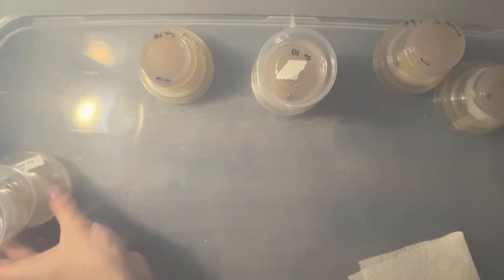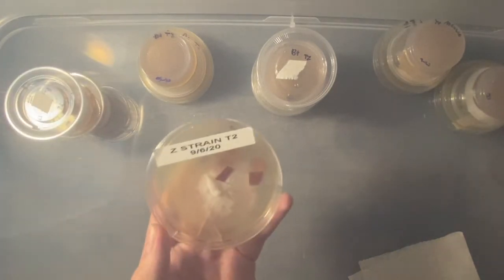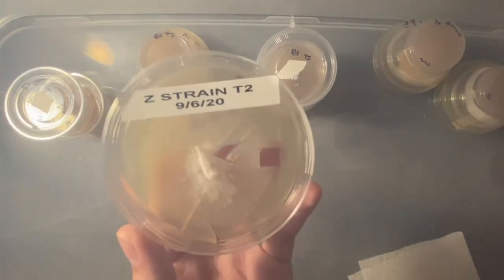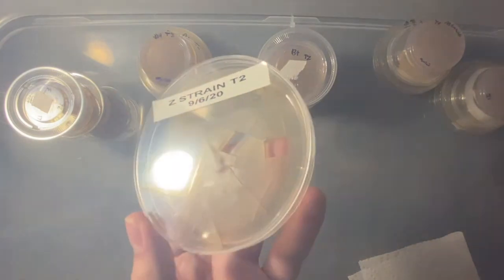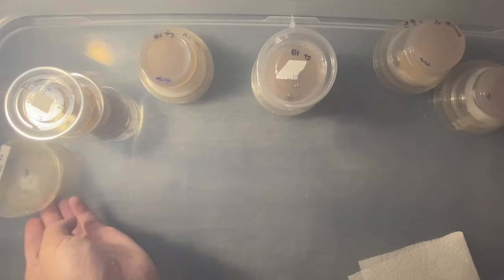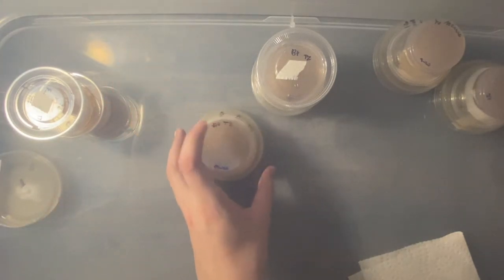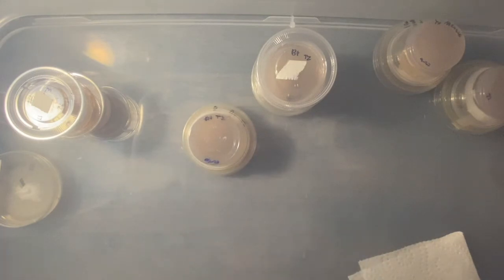It was my Z strain plate, my tier 2 that I recovered from a contaminated plate, and the mycelium growth is just so shitty on it. Hopefully I can get some good genetics, but I don't think so. Might as well take another piece from the spore print and just hope for better genetics.